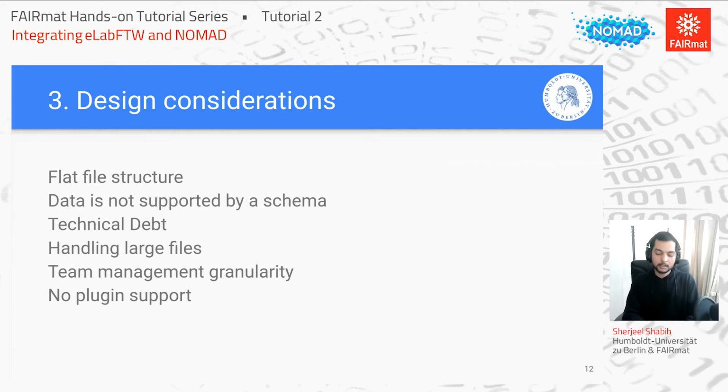But the problem with the way eLabFTW handles files is that it flattens them out in one sort of, let's call it a virtual folder, and attaches them with the experiment. The problem with that is, if we need some kind of folder structure to have projects, just like the microscope software would expect, we cannot recreate that unless we really change the way files are stored.